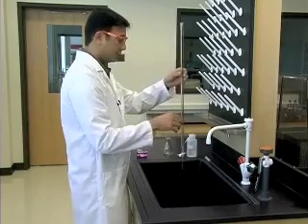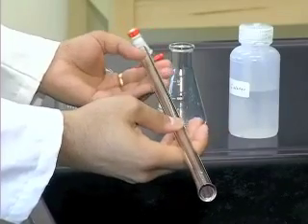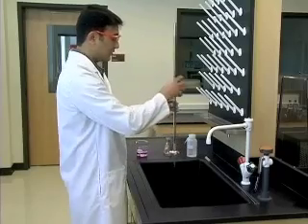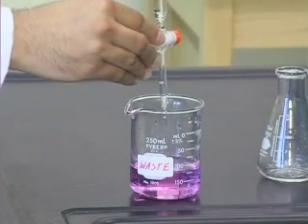Then flip the buret horizontal and rotate it such that it rinses off all the inner surfaces of the buret. Then bring the buret back to the vertical position, open the stopcock, and drain the washings into the waste container.